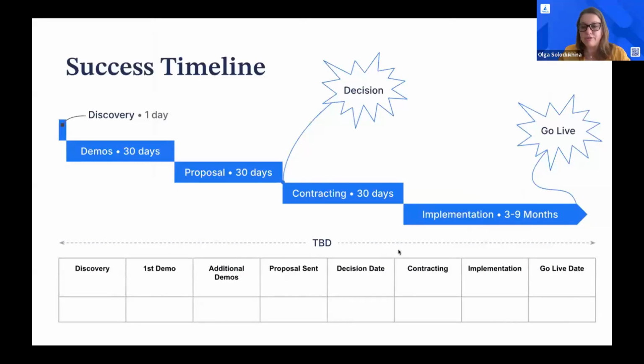And then we go live and everybody is happy. Of course, training and service come after that. We're always there for you. That's probably something to underline, that we're always working in a partnership mode. We don't just give you the system and leave you. We're always there. Our service is really superb, critical issues are solved within hours, and we're always there to solve any problems you have.